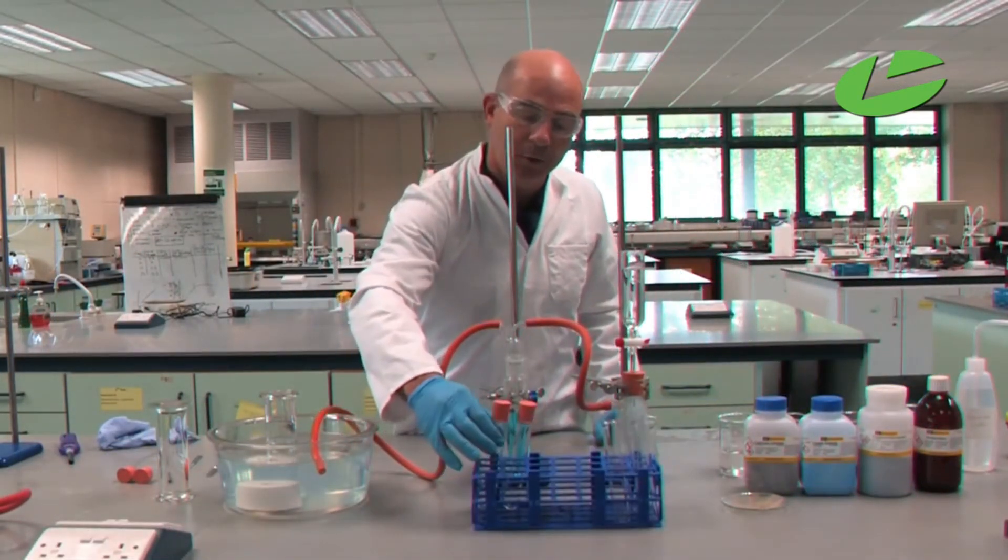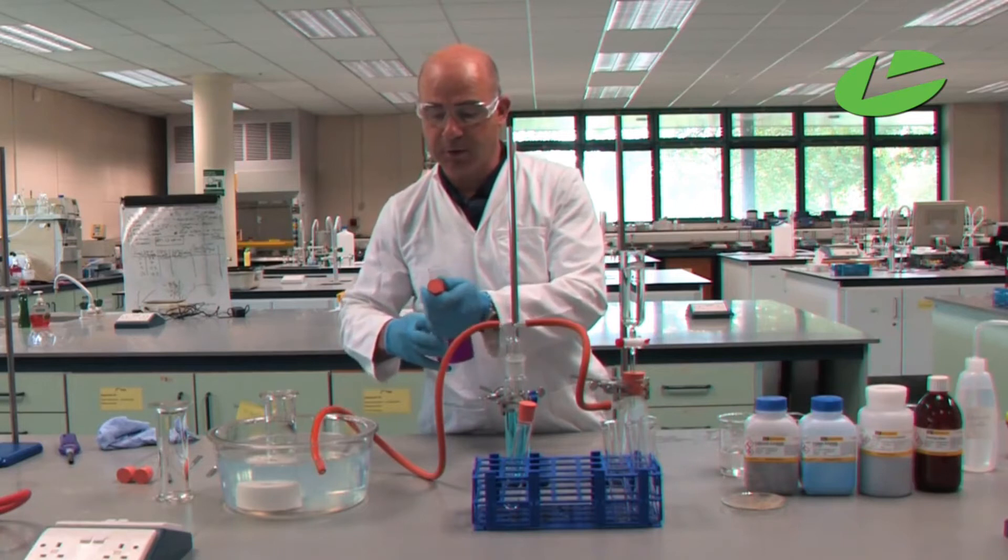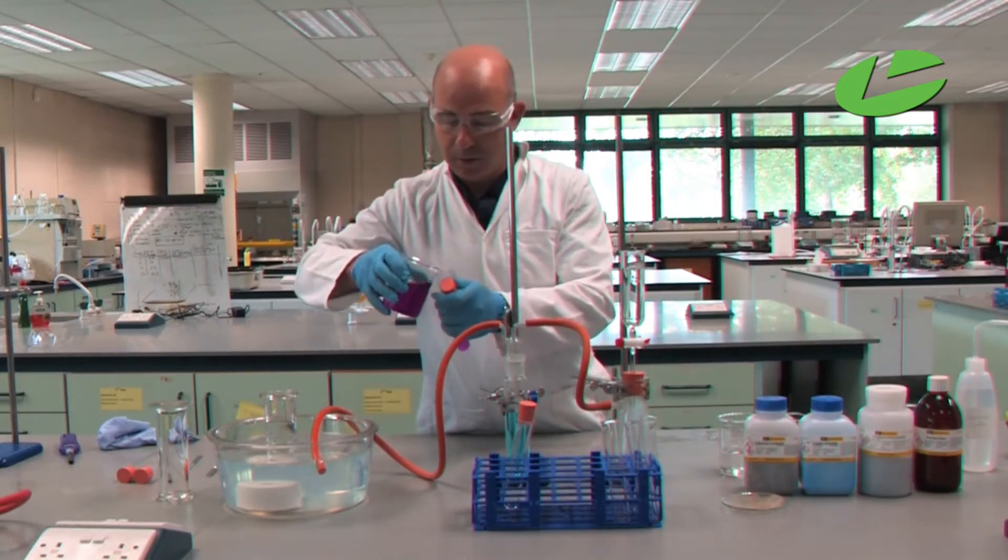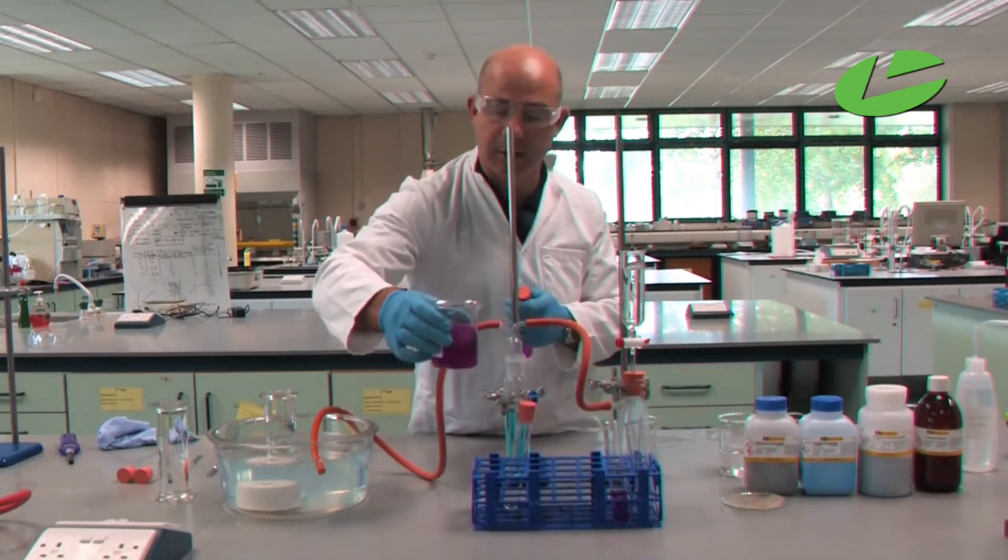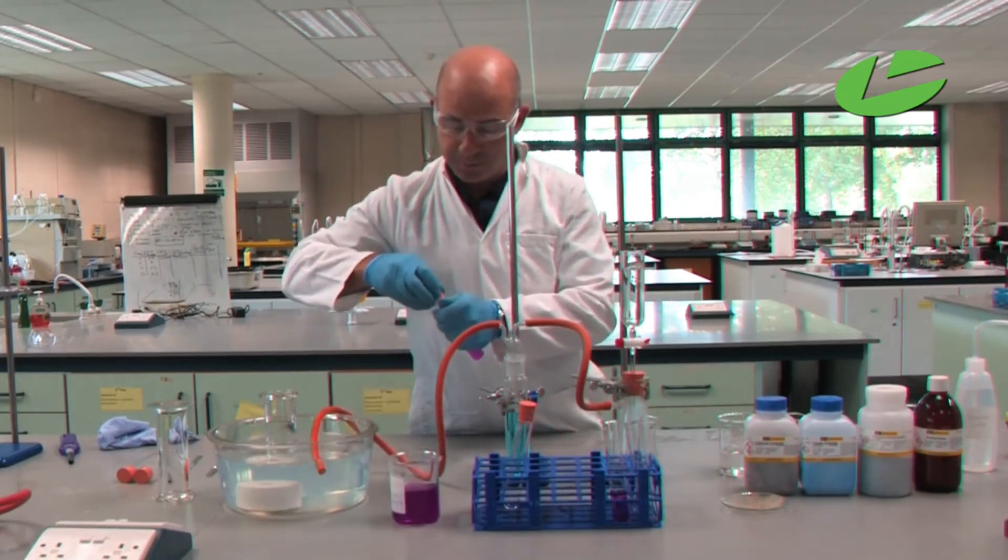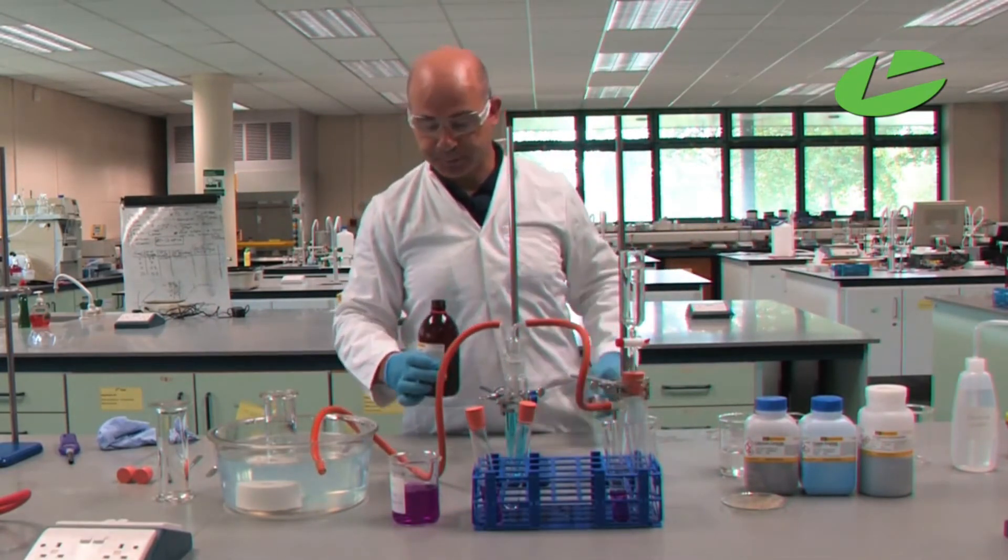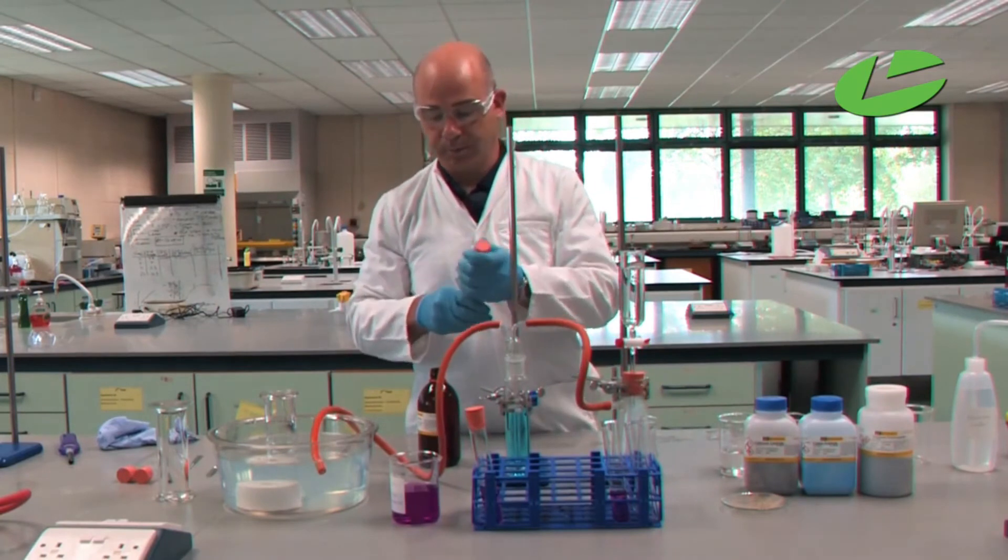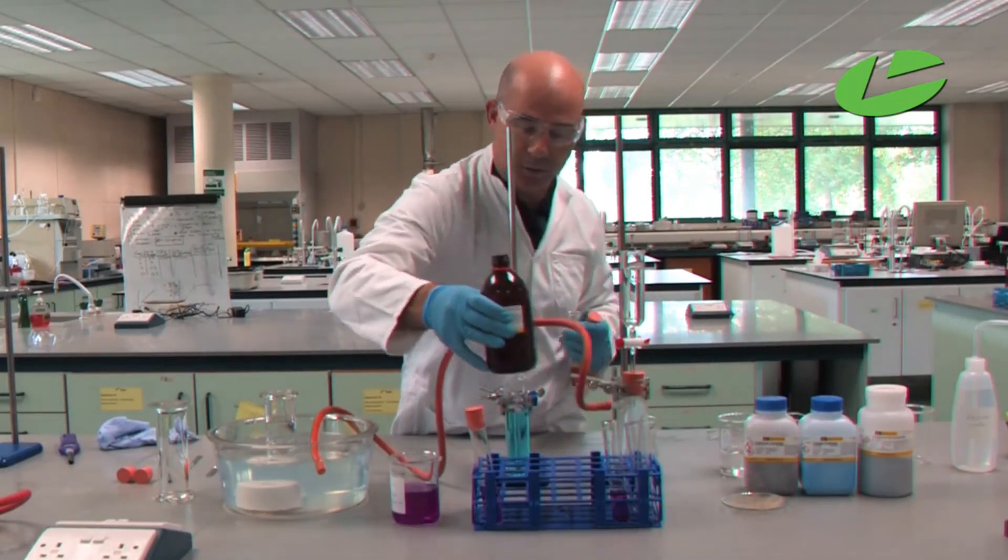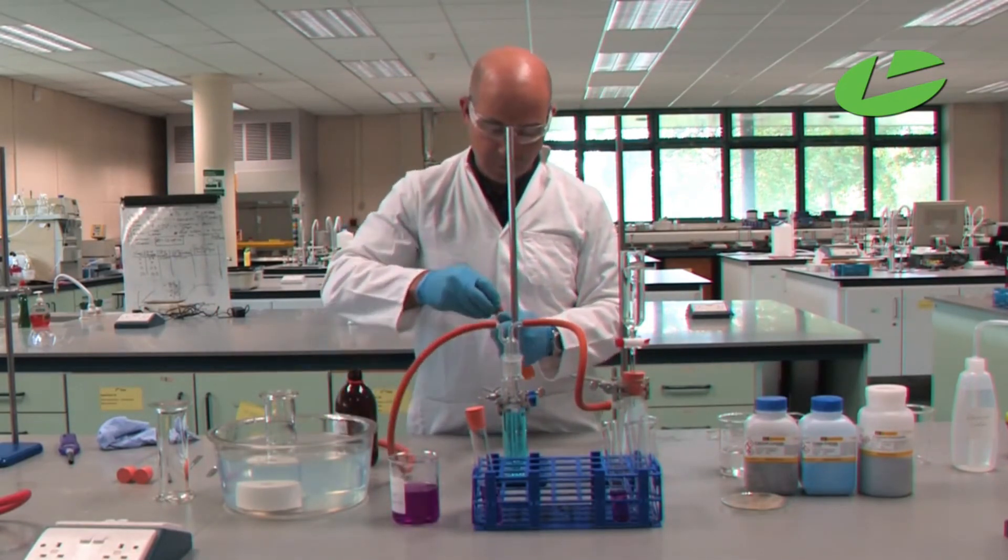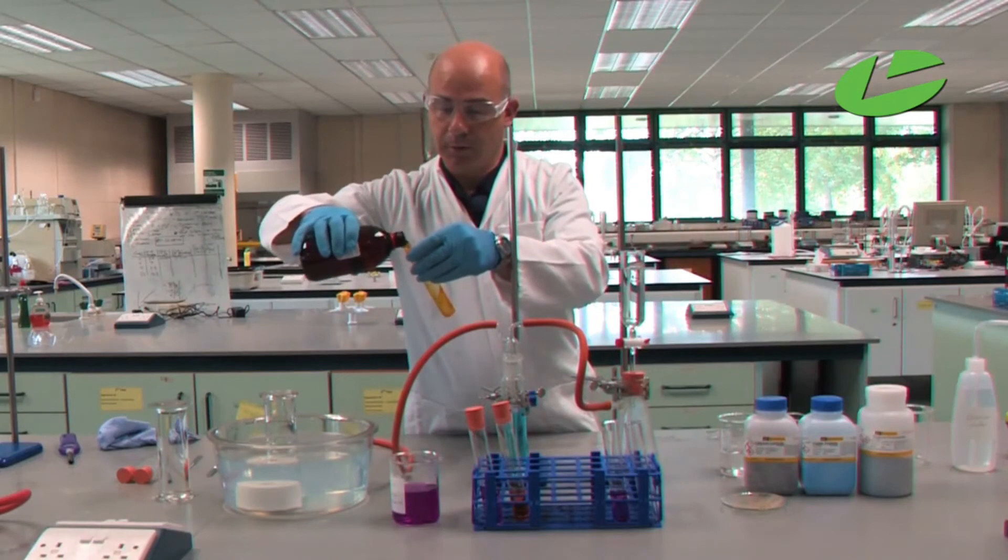In test tube one, add acidified potassium permanganate, this purple solution. It's advisable to have a test tube as well to show the color before the reaction. In another test tube, add bromine water. Prepare test solutions so you can see the colors beforehand.